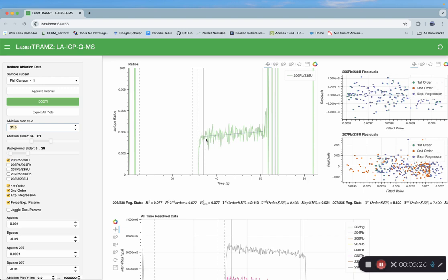In reality, most people just use wherever they select their first ablation, or wherever their ablation interval starts, be that due to ease of computation, or because we all know that regressions have a confidence band that drastically increases outside the boundary of where you've actually regressed data.